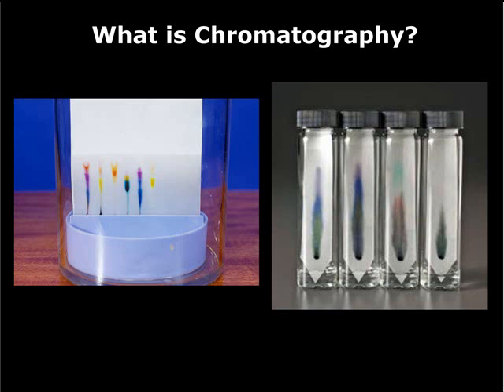Chromatography is a word derived from the Greek word chroma, meaning color. Chromatography provides a way to identify unknown compounds and separate mixtures. Chromatography is a method of physically separating mixtures of gases, liquids, or dissolved substances. Chromatography can be used to identify drugs, poisons, and many other substances. Separation is determined by the molecular size and/or charge.